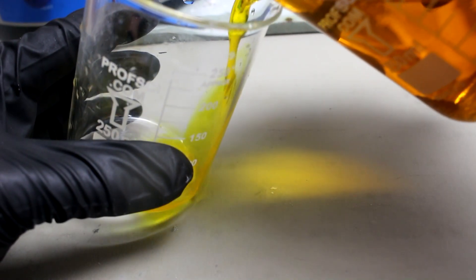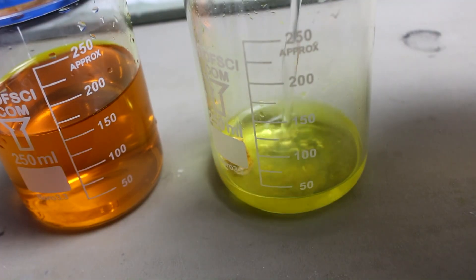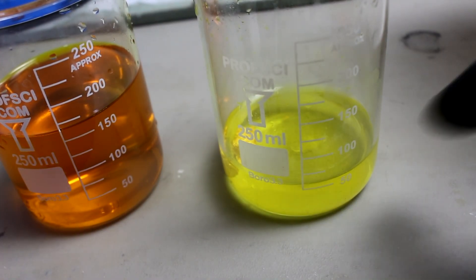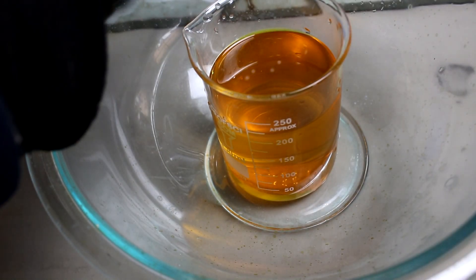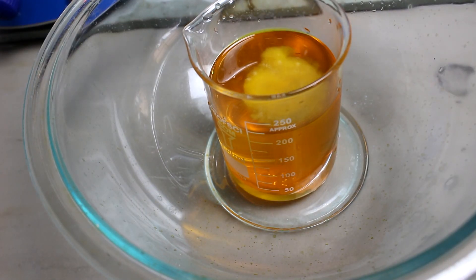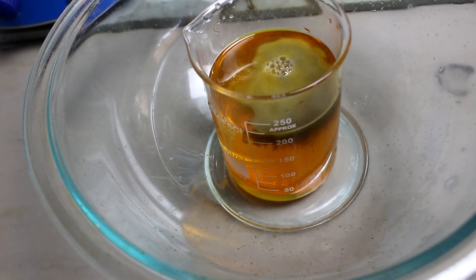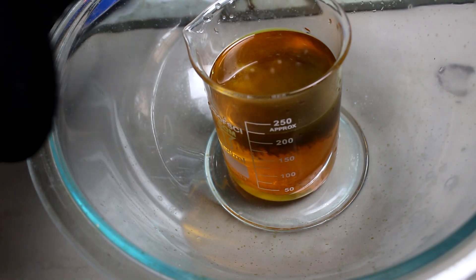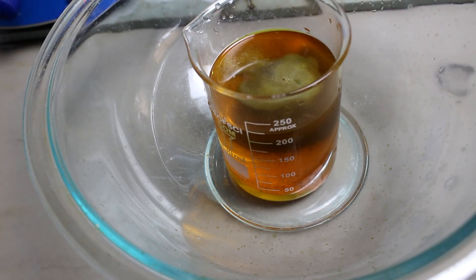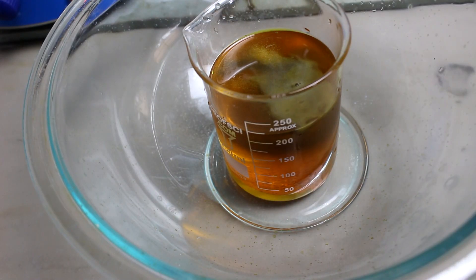I'm just going to carefully pour this liquid off, being careful not to get any of that silver in there. Now I'll just rinse this with some distilled water. To reduce the gold back to a metallic state I'm just going to add some sodium metabisulfite. That should precipitate some gold. The sodium metabisulfite actually forms sulfur dioxide when it reacts with the hydrochloric acid, and it's actually that sulfur dioxide that pulls the gold out of solution.